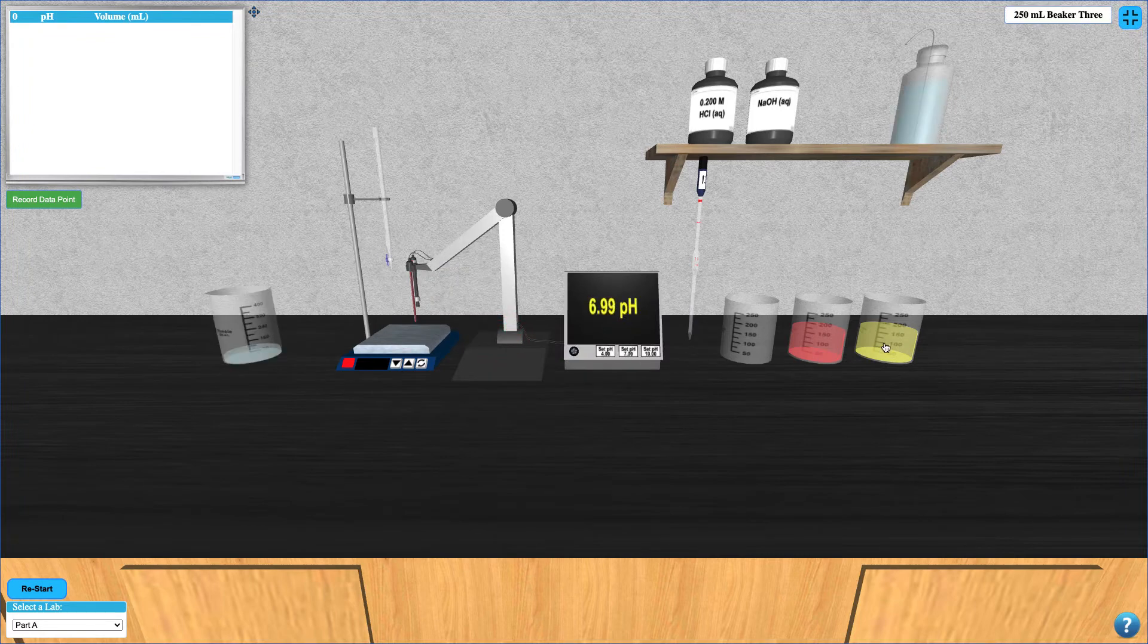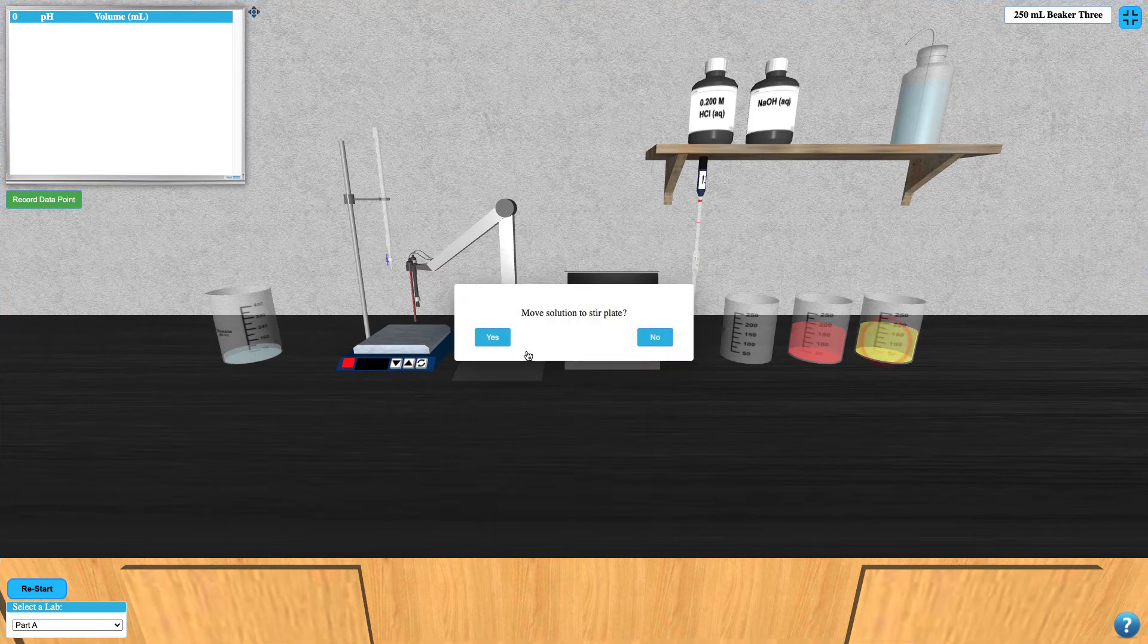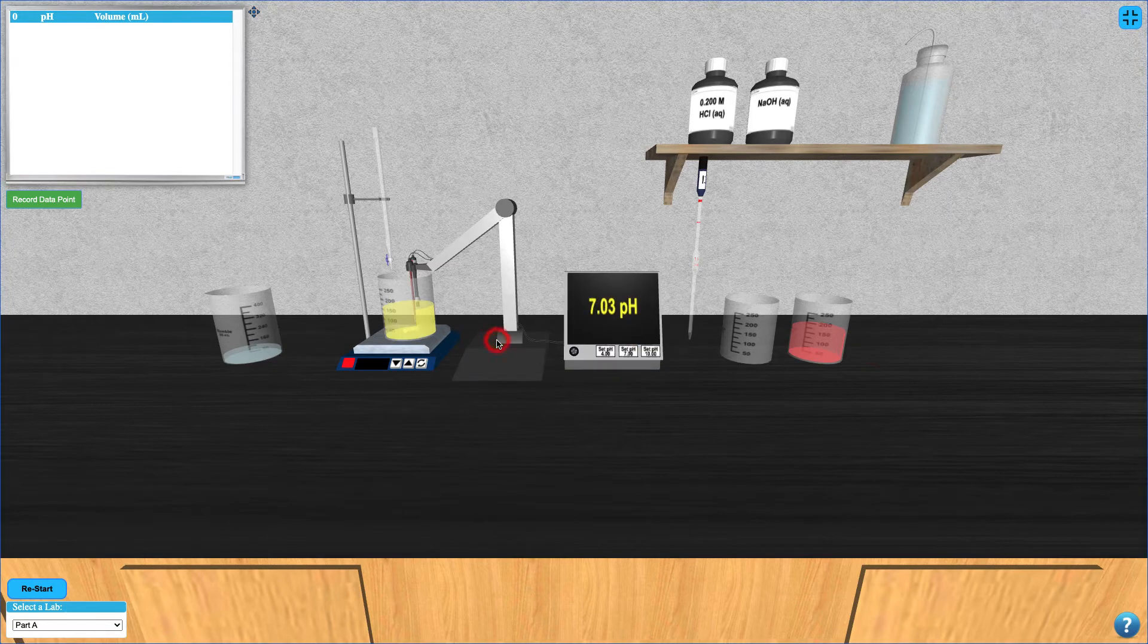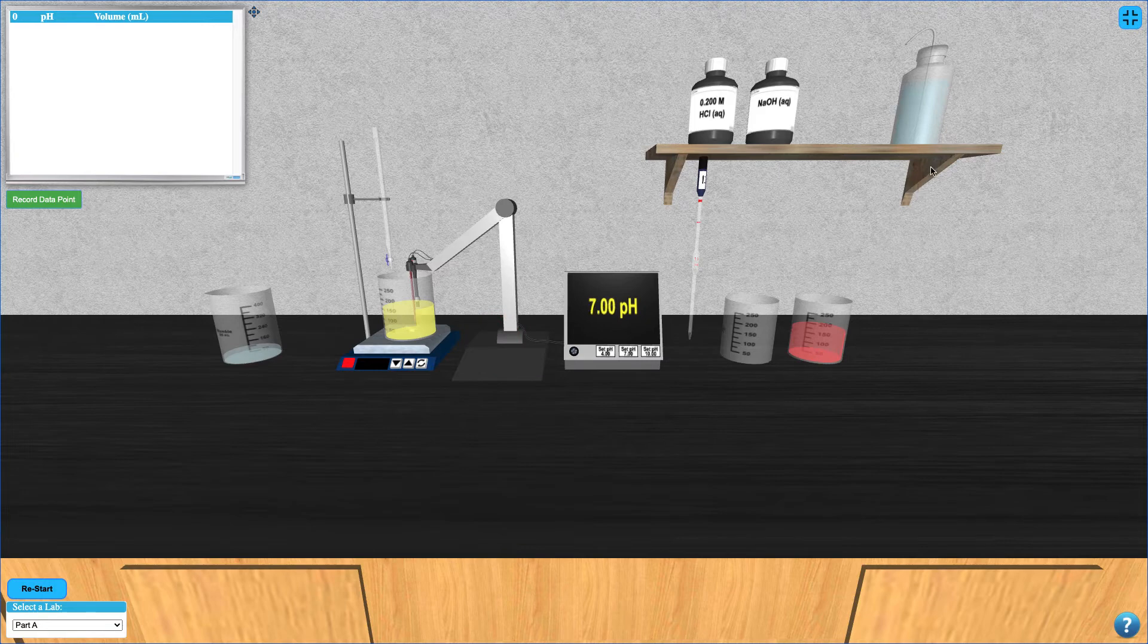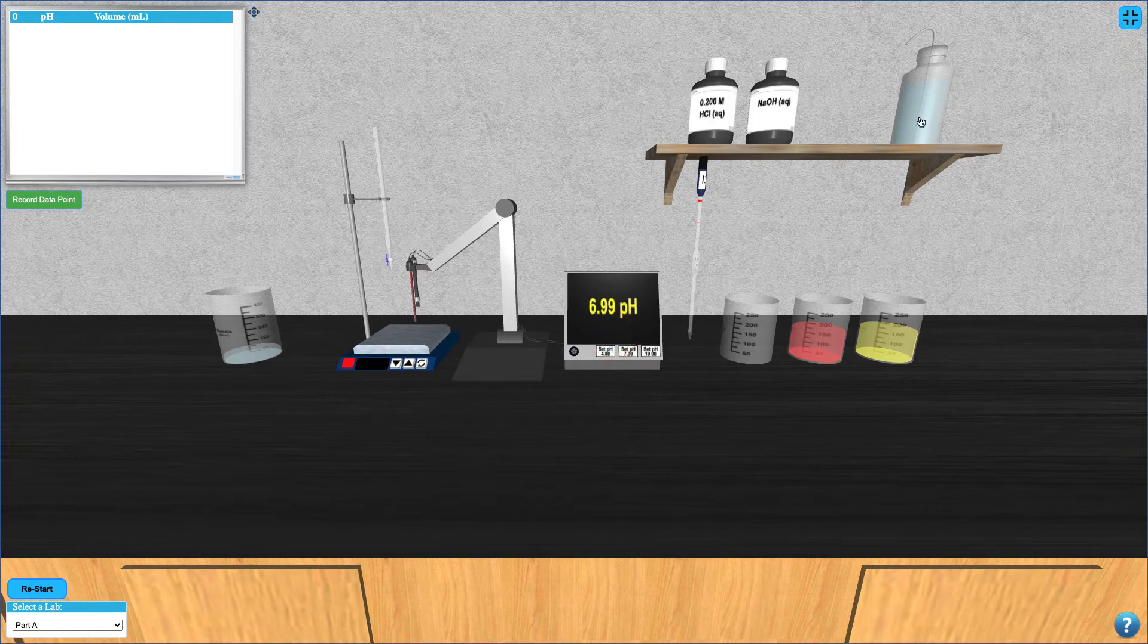Now it's time to calibrate the pH electrode, so click on the yellow liquid and add it to the stir plate. Once it's on the stir plate, click the middle set pH button to calibrate the pH meter to a pH of 7.